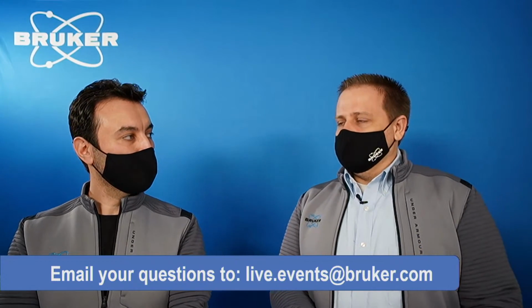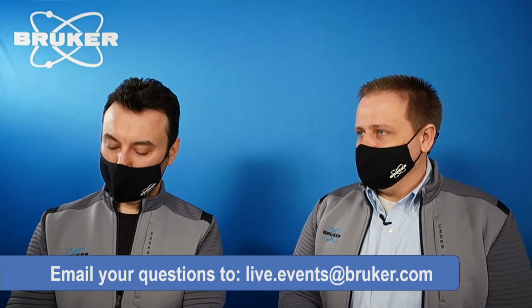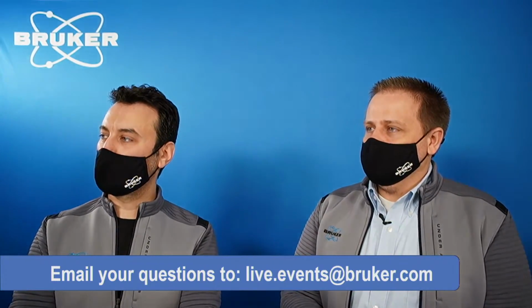So the first question that has come in is from William. And that question is, are these methods standardless? Or do I need to be able to create an accurate calibration curve with known samples due to matrix effects?